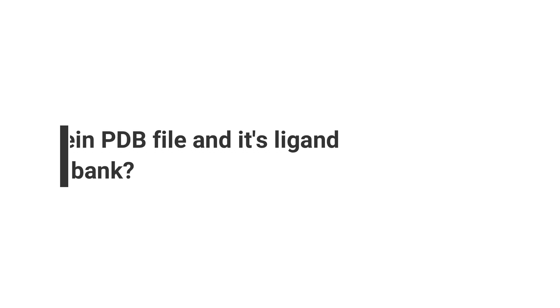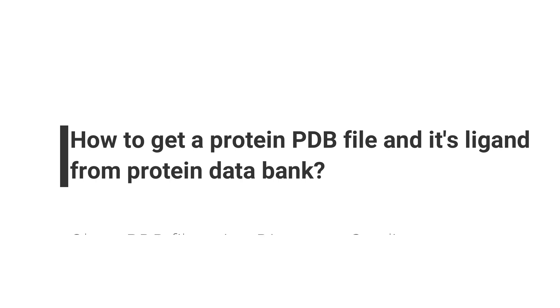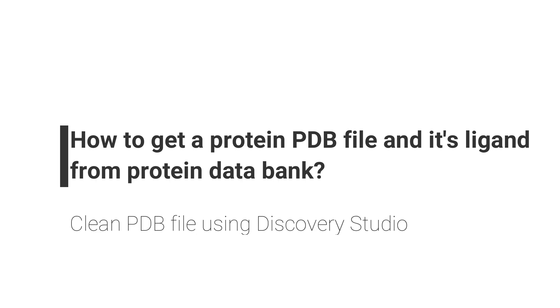In this short tutorial, I will demonstrate how we can download and prepare protein structure files and their ligands from the PDB site. Please note that every protein structure may not contain ligand structure details.